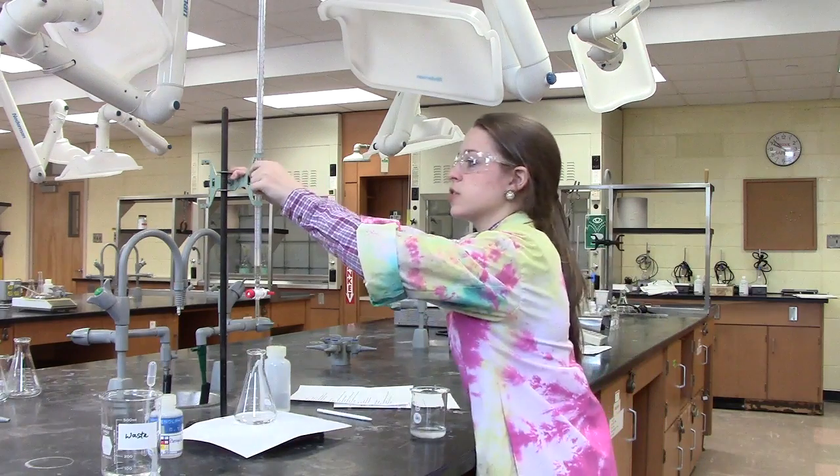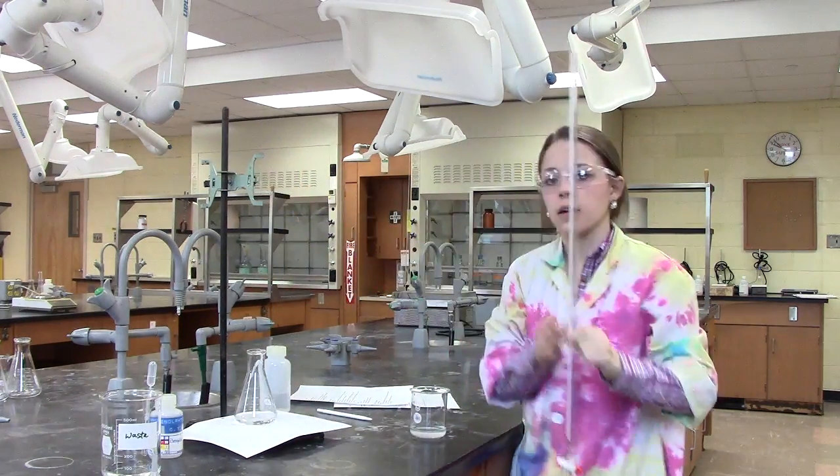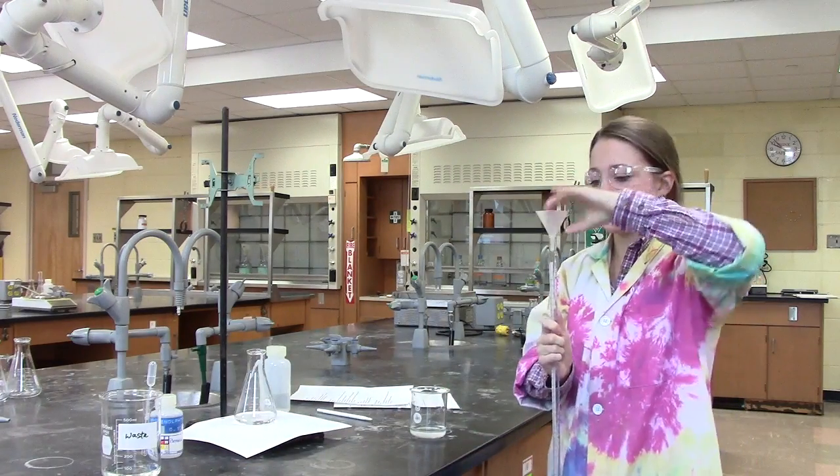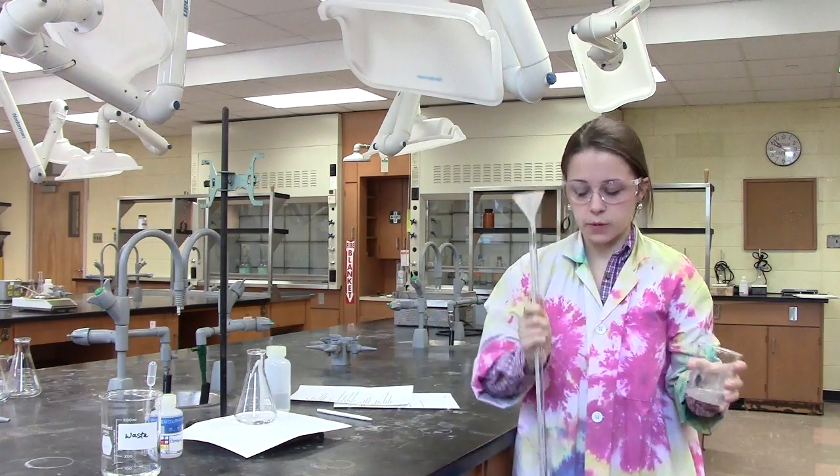In order to use a burette, we must first prepare it. This is done by first cleaning it, which is accomplished by using water without any soap or detergent. Once we clean it using water, we must rinse the burette with the solution that we are going to be measuring. In this case, we're going to be measuring a base, so I will rinse it with such.